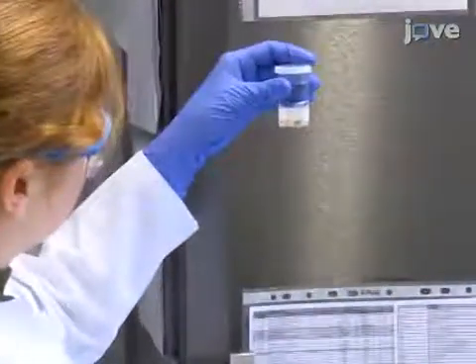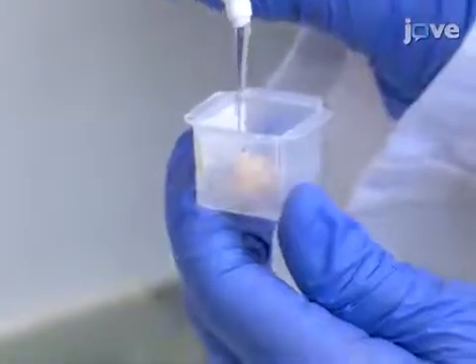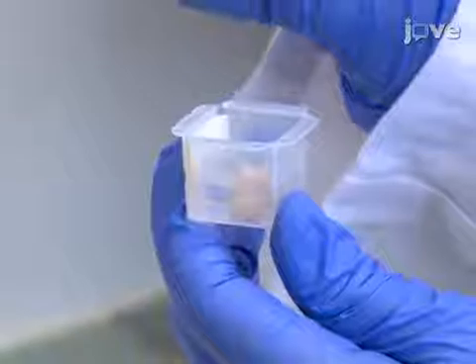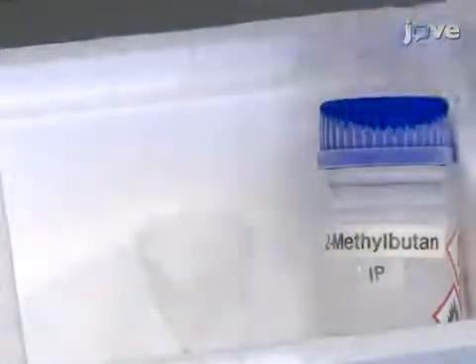After two days, when the brain has sunk in the sucrose, place the tissue into a cryomold filled with optimal cutting temperature compound and slowly freeze the tissue in liquid dry ice-cooled isopentane.